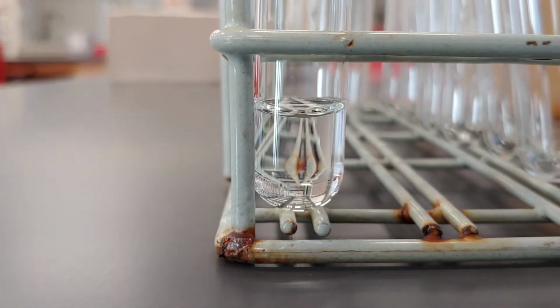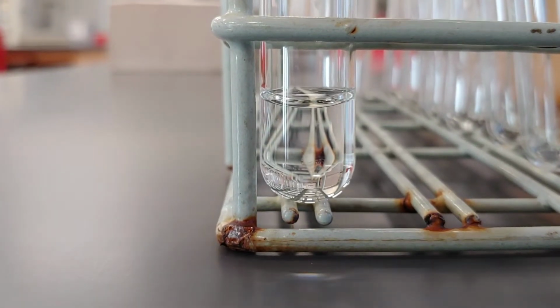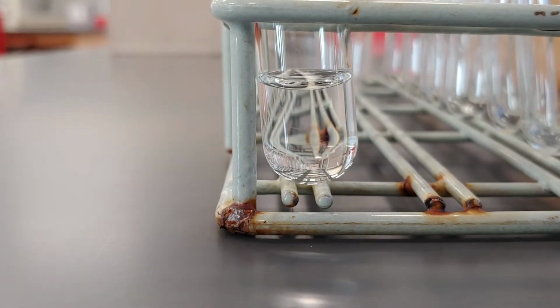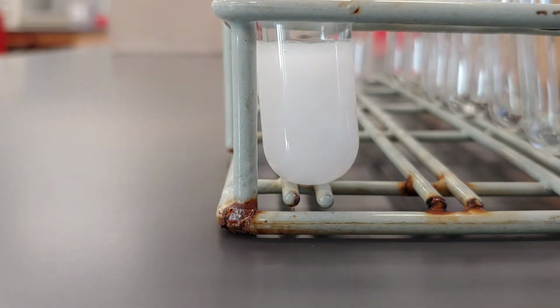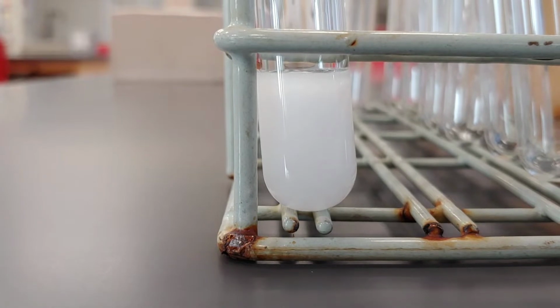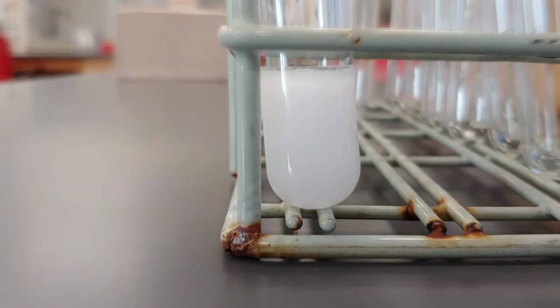All right, my first reaction is taking barium chloride, which is already here in this test tube, and adding some sodium sulfate. There we go, barium chloride plus sodium sulfate. That was reaction number 1.